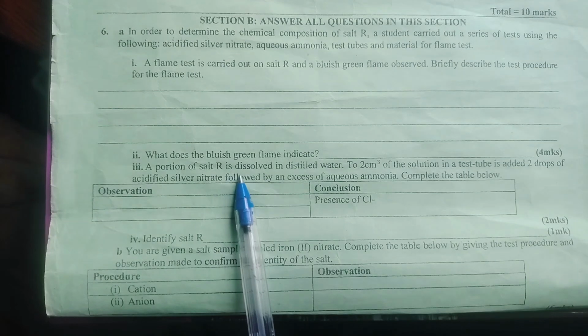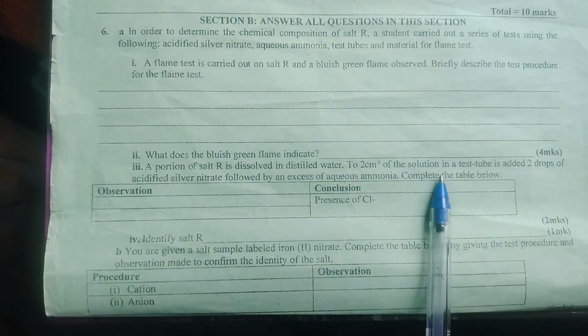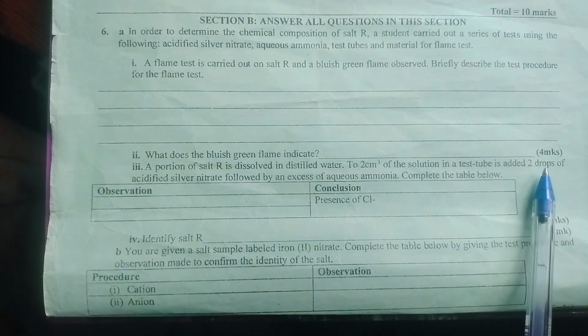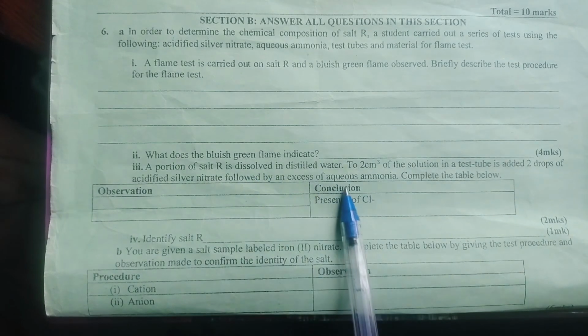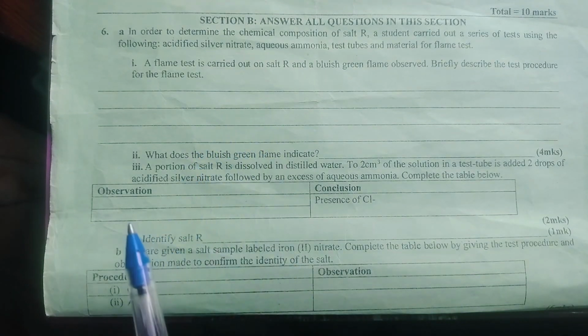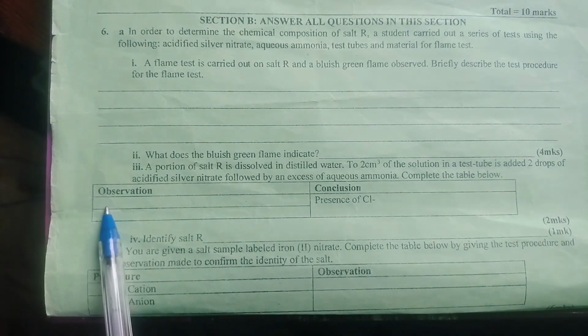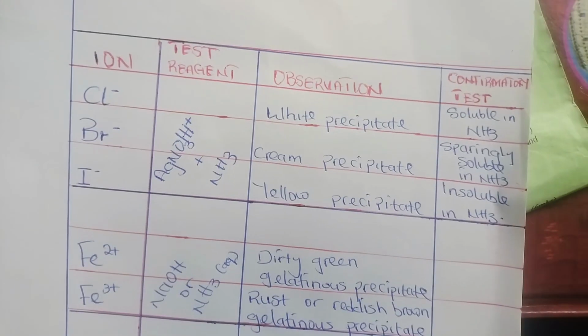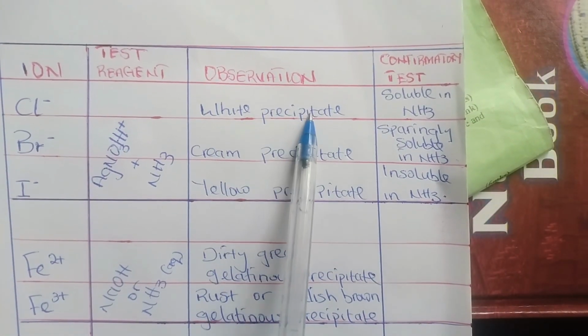A portion of salt R is dissolved in distilled water. To 2 cm³ of the solution in the test tube is added 2 drops of acidified silver nitrate, followed by excess aqueous ammonia. Complete the table below. Now, presence of chloride ion. What is the observation? From what we had, this is our chloride ion. What is the observation? A white precipitate.